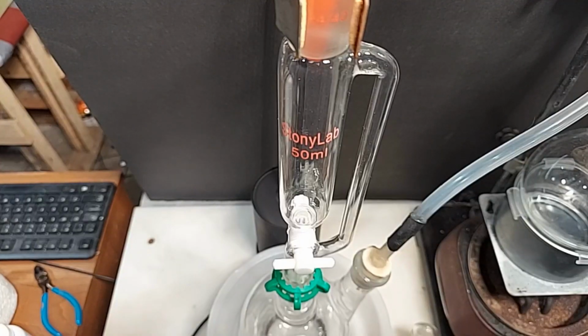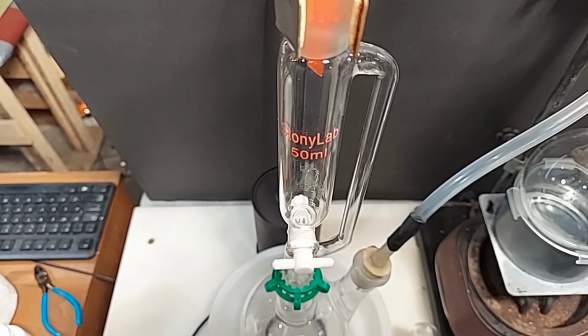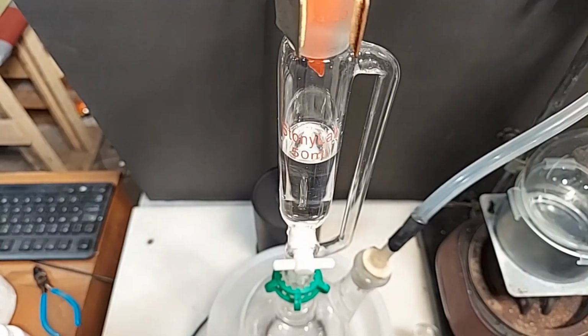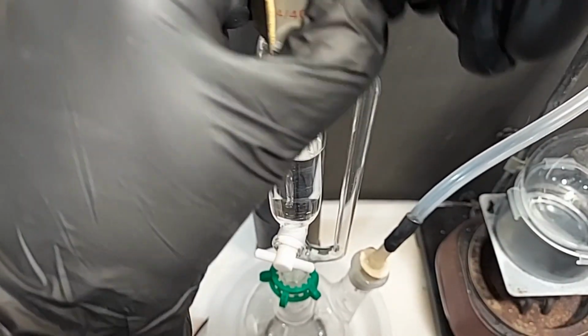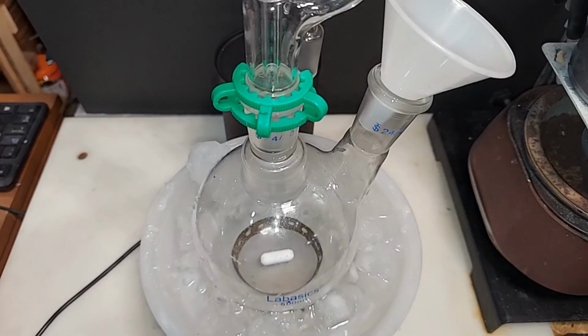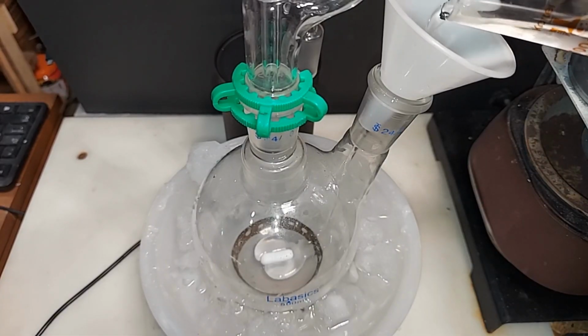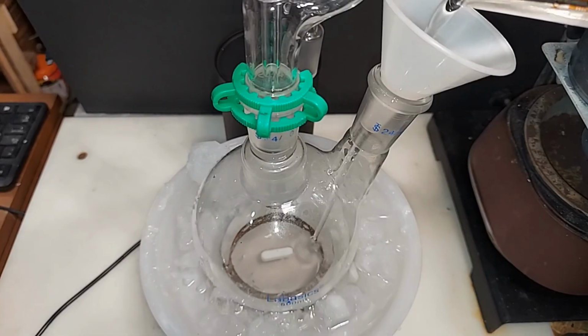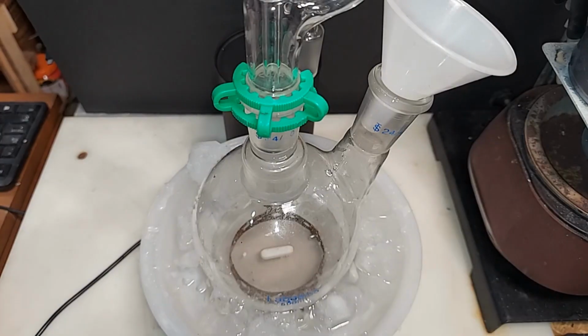The first thing we're going to do is add the methanol to the addition funnel, and that's always because if your addition funnel is leaking, you don't want anything in the round bottom flask. All right, going to be adding the stopper. Okay, done. Next, we're adding our sulfuric acid. This came right out of the freezer, so it is definitely cold. As you can see, I also placed ice around the bottom there, because all of this is going to be highly exothermic. And I'm going to turn the stir bar on initially pretty low.